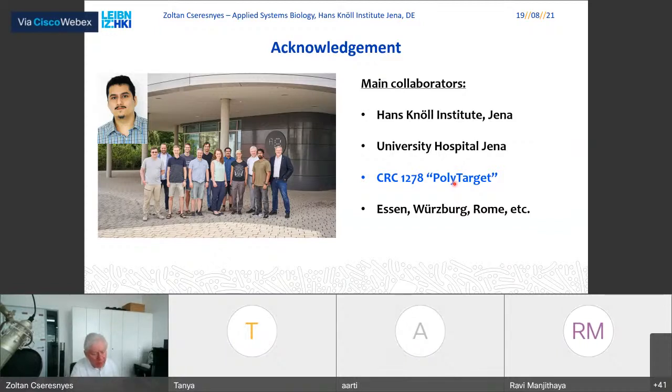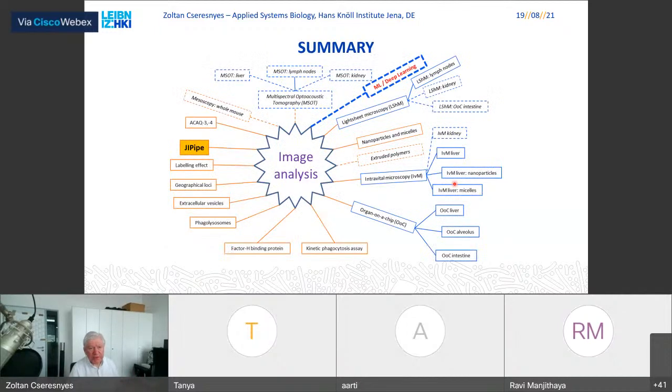Yes, of course. As I hopefully mentioned at the beginning of the lecture, I have focused on this particular application, but the principles are very, very similar in many applications. The summary slide also served that purpose, to show you that this is not limited to host pathogen interactions. The subject of this session is that, but from this you can also generalize the techniques to others. We use, for example, the tool to analyze the movements of nematodes, worms, C. elegans, which have nothing to do with macrophages, but the same principle and analysis techniques, even Hessian filtering, works quite well for that too.